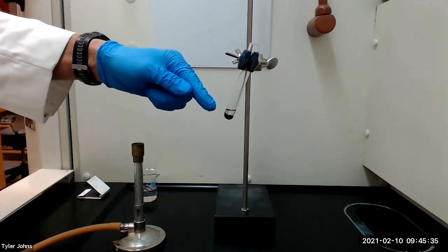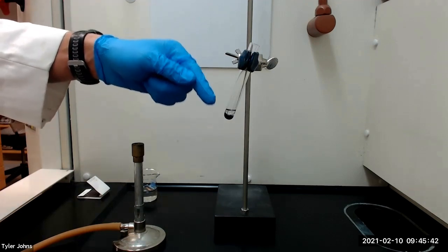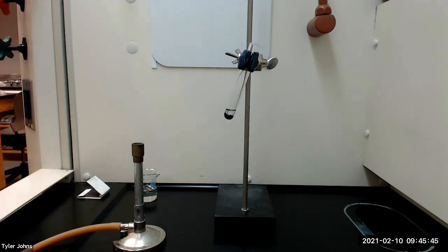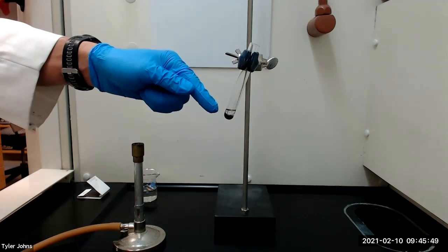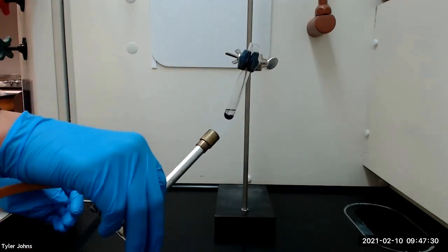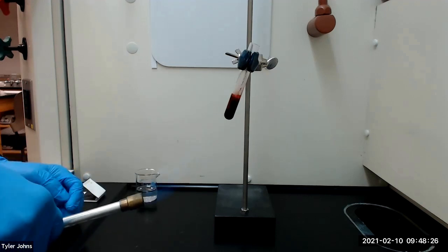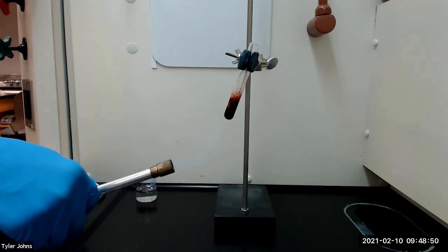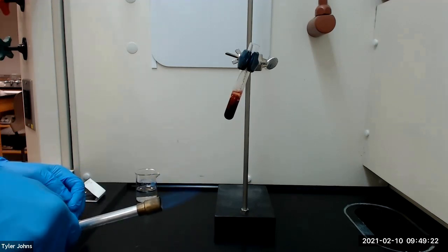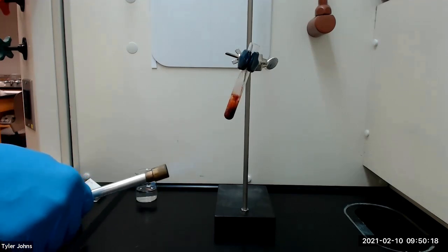We will next bring the reaction mixture to a boil using a micro burner by moving the flame of the burner over the bottom of the test tube. On melting, the reagents will dissolve in the silicone oil to produce a dark red-purple solution. We will continue to gently boil the reaction mixture for 10 minutes, and during this period the deeply colored solution will fade and hexaphenylbenzene will begin to separate from the solution as tan crystals.